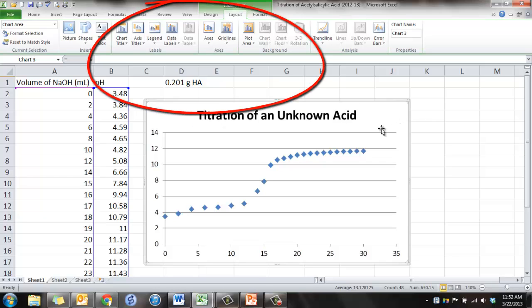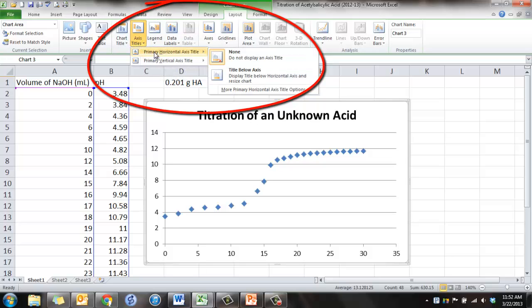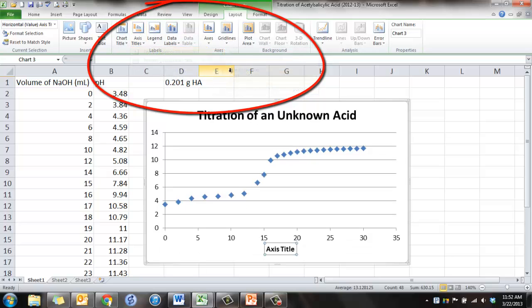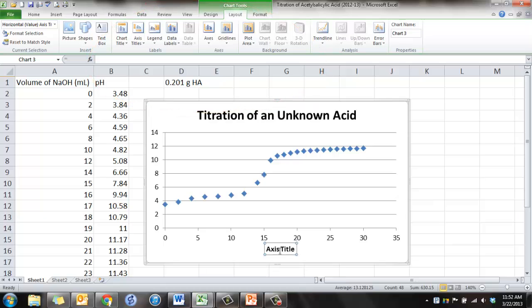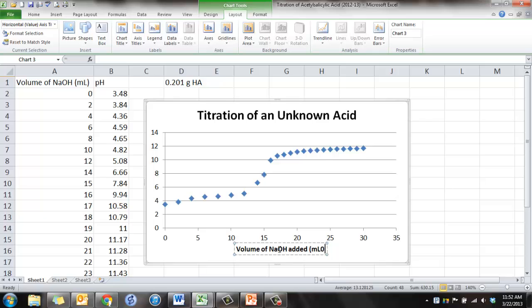Again, click on the graph so you can see your three choices. Now let's click on the Axis Titles, and we'll do the horizontal axis, which is the x-axis. And this title should be, well, what was it? It was the volume of sodium hydroxide added, and it was in a unit of milliliters, so put that in parentheses.